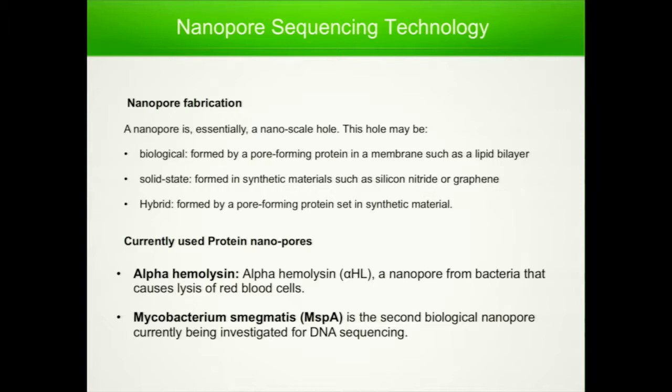There are proteins in the membrane, right? I want to select a membrane protein which is a pore-forming protein. That protein is so specific, so consistent, that it will create a pore of a consistent diameter. And then if you look into the literature, you have two here.